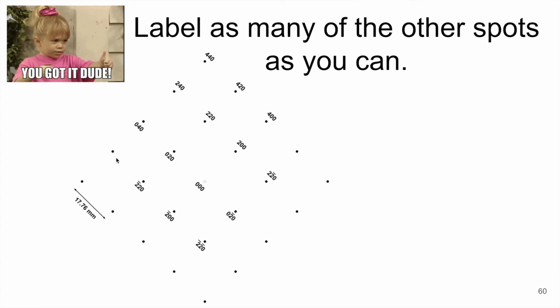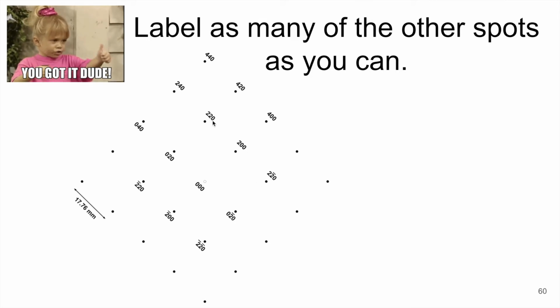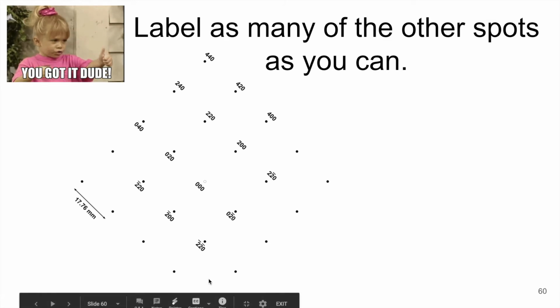So we're basically looking at the xy plane in this case. This is 220, so if we double the distance, that would be 440. Then we can look at bar 2 bar 2 0 in the same way, and then bar 4 bar 4 0 down here in the corner that is being hidden right now, right here. Same thing there.